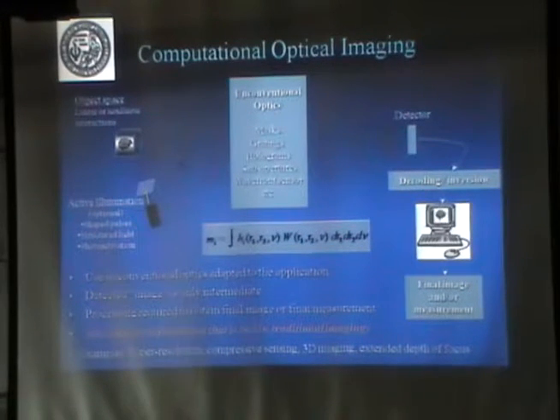Any other guess? You can look here and have more than that, because we talk about this coherence function. We talk about the concept of coherence. So if light is coherent, you have 3, 4, 5 dimensions, depending how you count. You have amplitude, which is not a dimension.